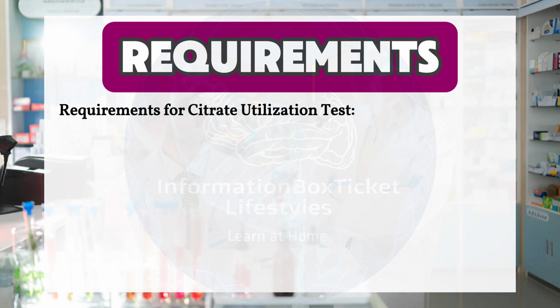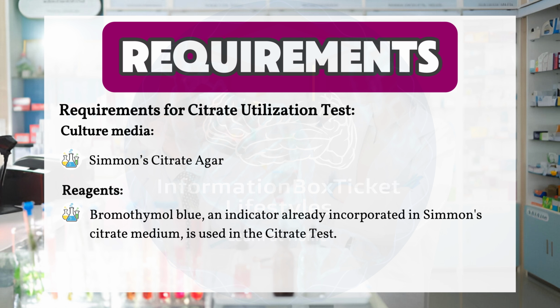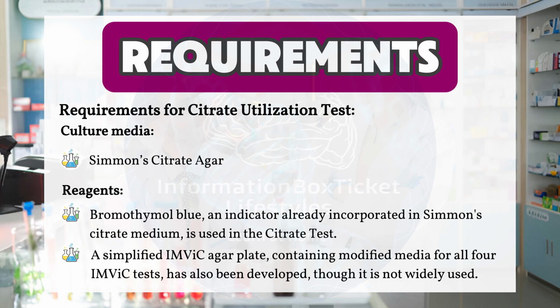Requirements for citrate utilization test: culture media, Simmons citrate agar. Reagent: Bromothymol blue, an indicator already incorporated in Simmons citrate medium, is used in the citrate test. A simplified IMViC agar plate containing modified media for all 4 IMViC tests has also been developed, though it is not widely used.